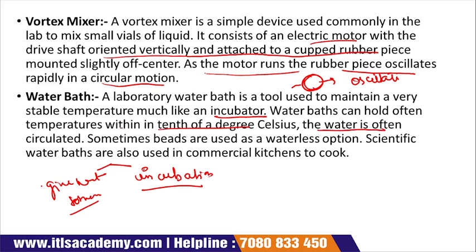The water is often circulated. Sometimes beads are used as a waterless option. A scientific water bath is also used in a commercial kitchen to cook. This is all about the function of the water bath.